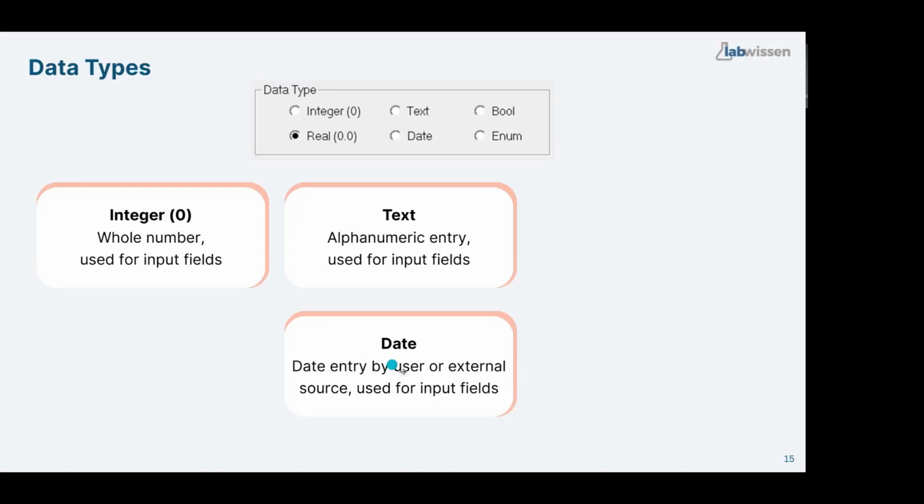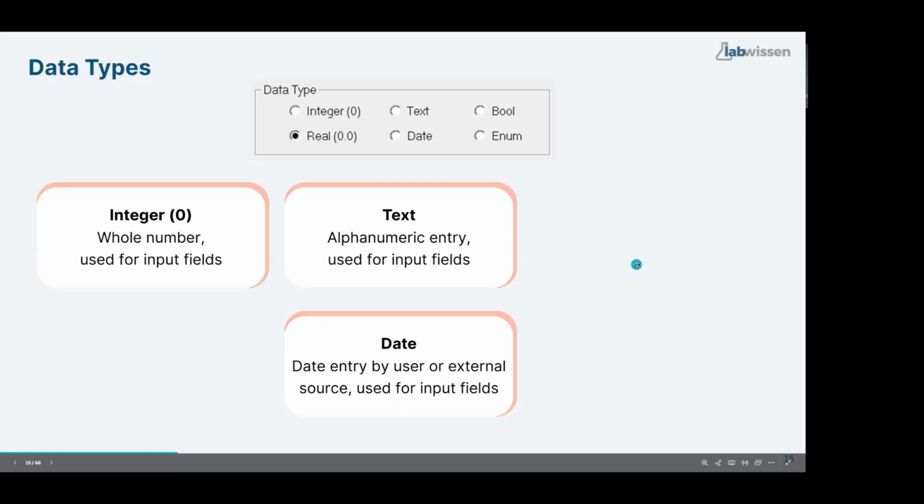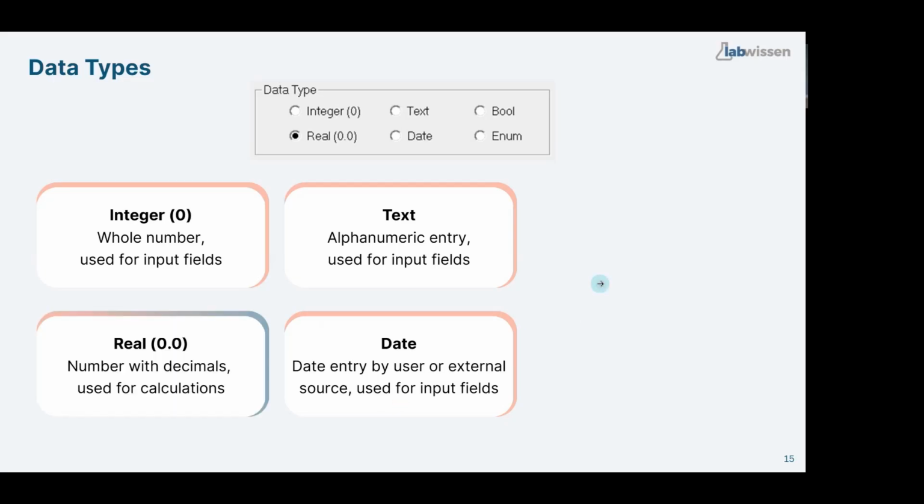Truly speaking, I never used this one. Maybe someone can share later the experience of using it, but I never used it. Why should I put a date in my custom field? Okay, I can assume maybe if I do my sample prep and then I put the date inside, but I can use text instead, right? So never used it, never heard of someone using it, but it's there. You can try it yourself.